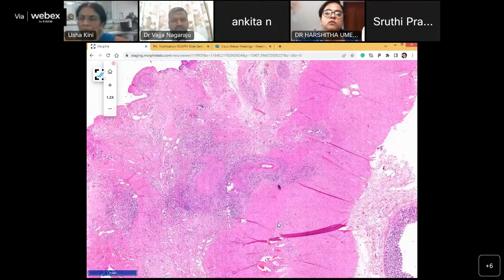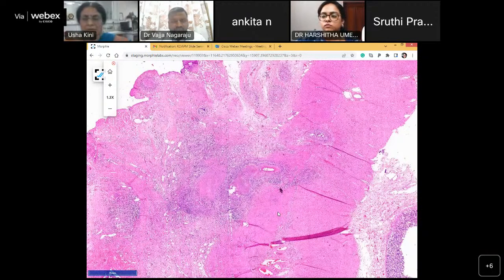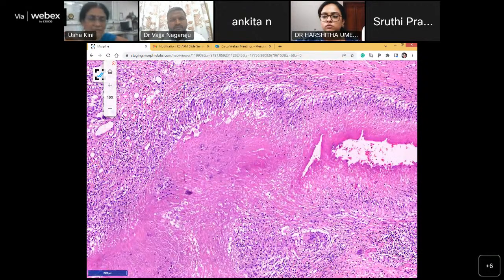Because it is acellular material, eosinophilic, with nuclear debris. And it is palisaded by what? Epithelioid cells. Wonderful. And you have what? Multinucleated giant cells, foreign body giant cells.